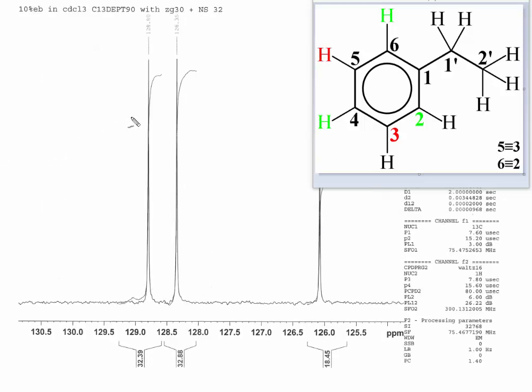And so in the original, we can say that's carbon 3, that's carbon 2, and that's carbon 4. Without doing the J resolved showing the hydrogen splitting of the carbons, it would be difficult to assign these carbons by any other means.